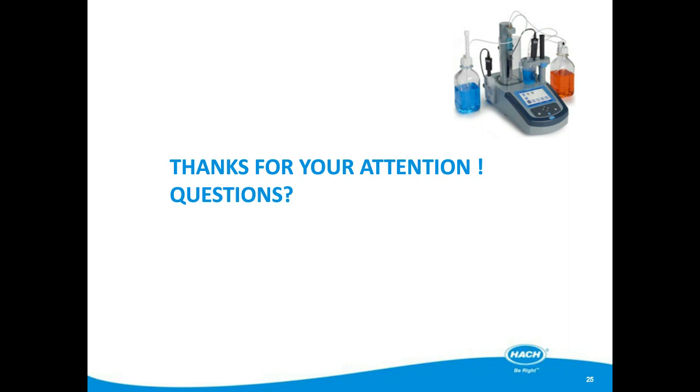Okay, so the maintenance for an automatic titrator is very low because it's not like manual titration. For instance, we don't have to rinse the system and so on. If I take the example of the total acidity, you will only have to calibrate the pH probe like a pH meter. All is automated. You have guided steps, so it's very easy to do.